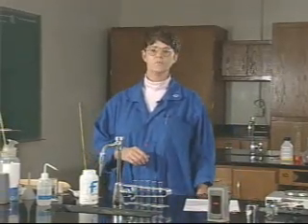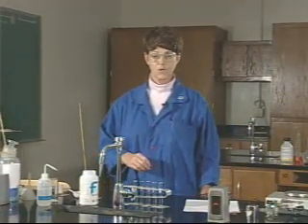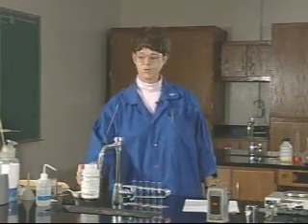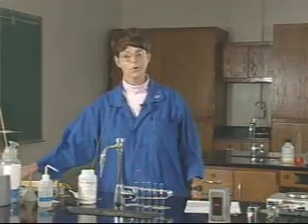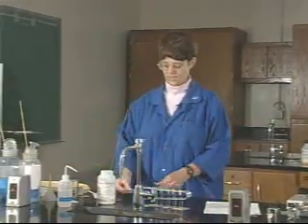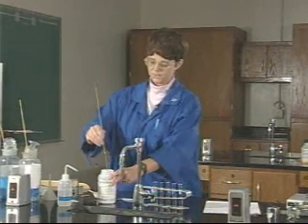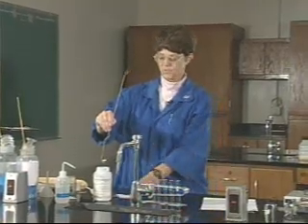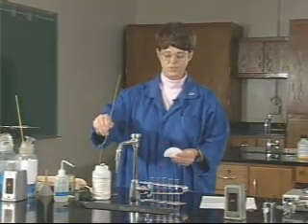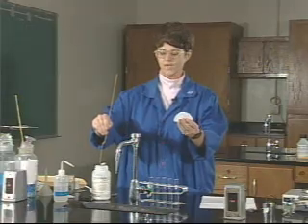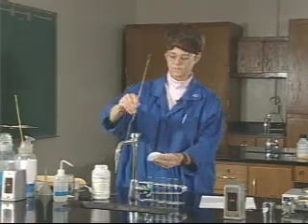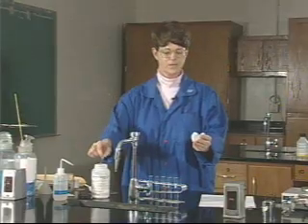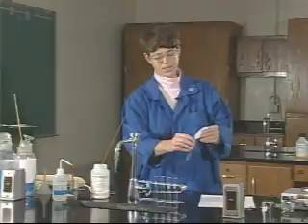In the first part of the experiment, we're going to measure the solubility of sodium chloride in water. To do this, we're first of all going to get some sodium chloride, which is table salt, and we're going to put it into a test tube. The scoop would be a little bit hard to put the sodium chloride directly into the test tube, so we'll get a piece of filter paper, fold it a little bit, put the sodium chloride on the filter paper, and then simply add it to the test tube.